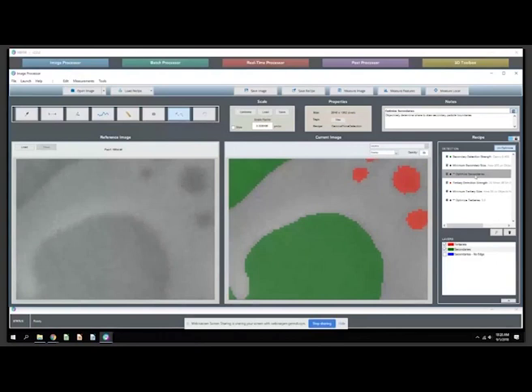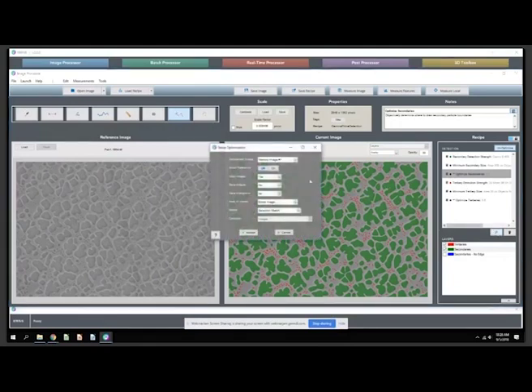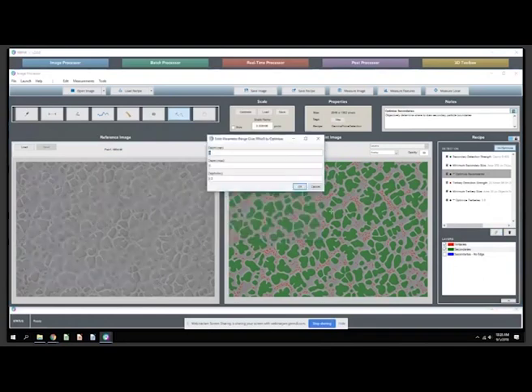We've renamed it optimize secondaries, so it's clear what the purpose is. But what you'll see is if we run this optimization, and this is something that happens automatically every time you run the recipe, so it's flexible and dynamic image to image, but let's see what it looks like. So if we edit the optimization, all these settings can stay, and we say I want to try shrinking the particles from a strength of nothing up to a strength of 5 with half steps.